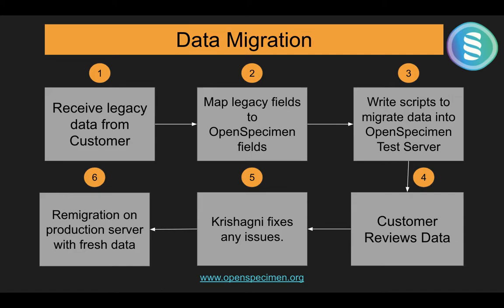With this migrated data, we will ask you to review all the data. Once you come up with some feedback, that this needs to be migrated, these are errors, this needs to be fixed in the system, this needs to be fixed in the ETL scripts, after all such feedback loops, we will finalize the ETL scripts. At the same time, we will ask you to fix any issues in your data at the source.